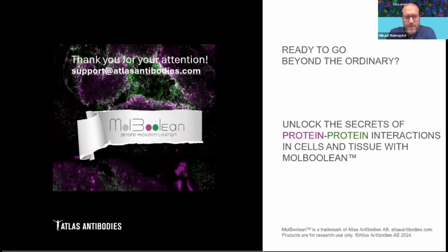Yeah, so it also depends on what you have. If you don't have a confocal or advanced microscope, you will still be able to do it with a standard epifluorescence microscope. Yes, people have used MolBoolean with a standard epifluorescent microscope. What I wanted to add is that not only do we do image deconvolution, we also have a module within the image analysis pipeline where you sharpen the objects before segmenting them. So there are ways of sharpening objects, so you can also use non-confocal images.